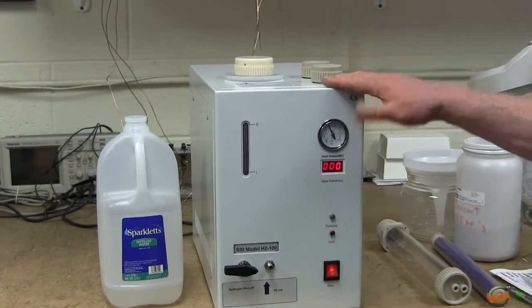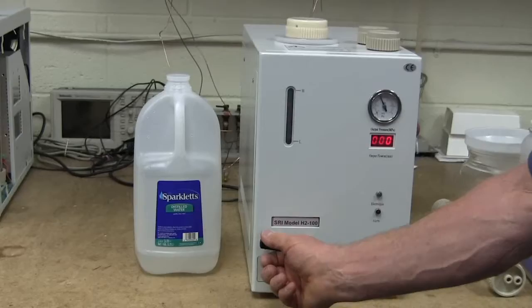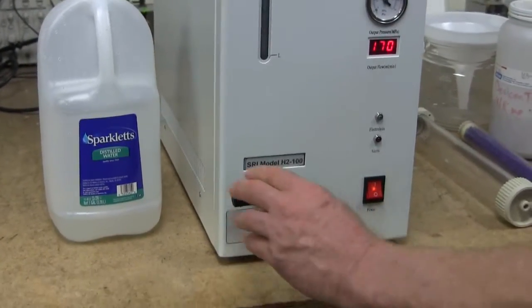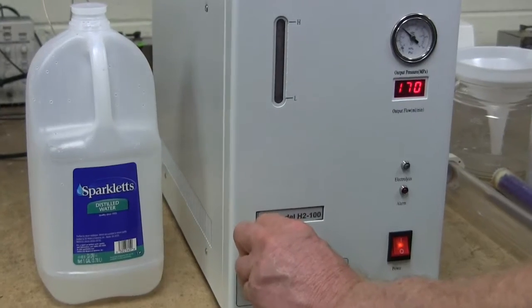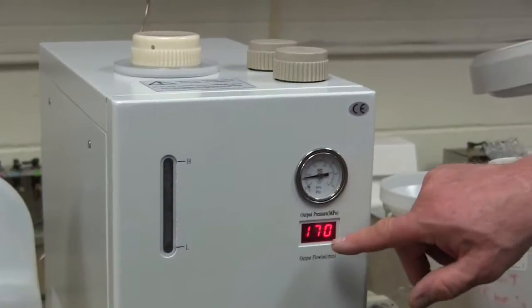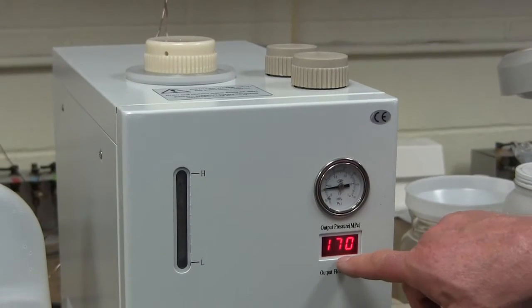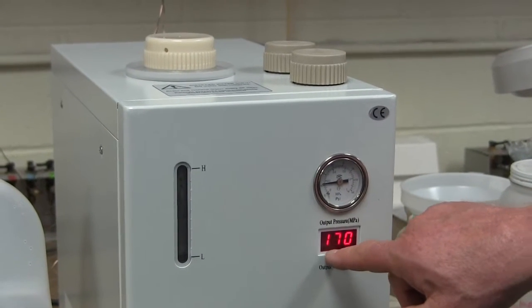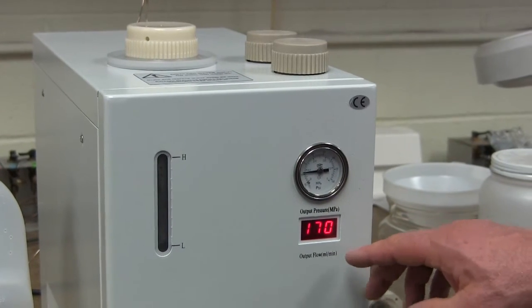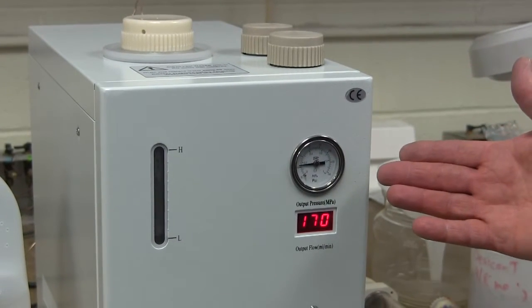So it comes in this box. There's a gas on and off switch here. If I turn this, you can hear the hydrogen coming out and you can see the pressure gauge dropping. And now you can see the output flow, which is displayed here. 170 means 170 milliliters per minute. So it's making hydrogen right now.